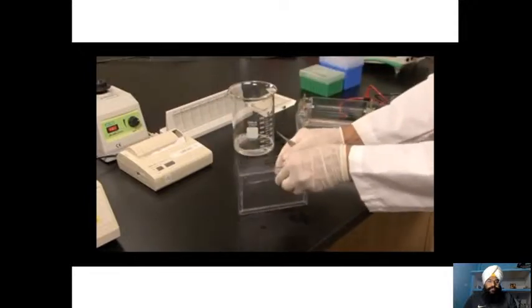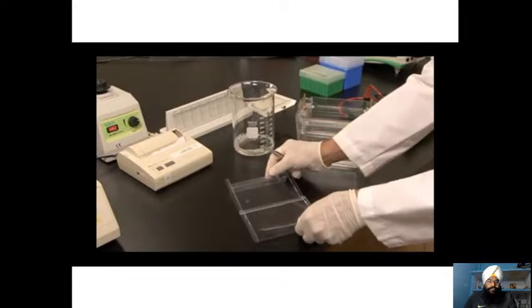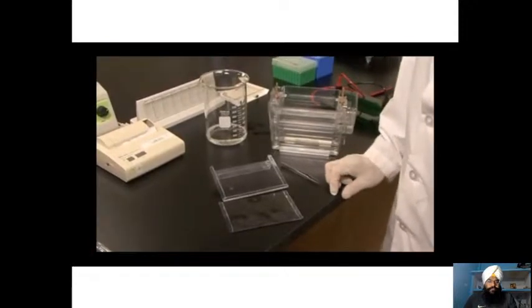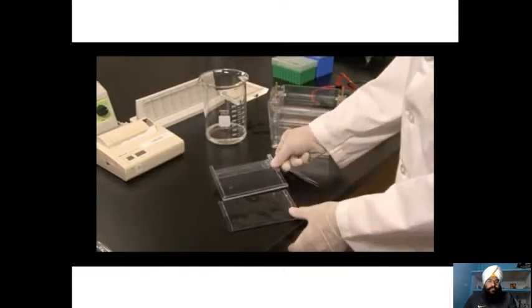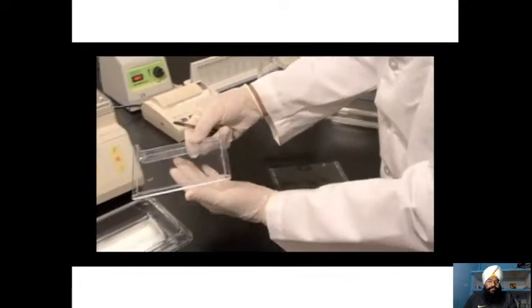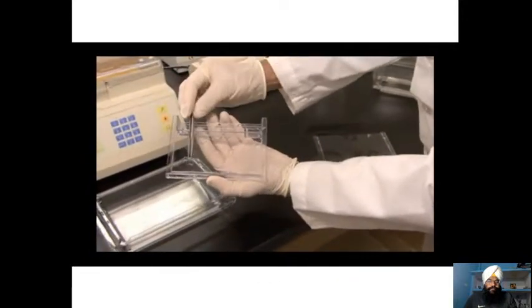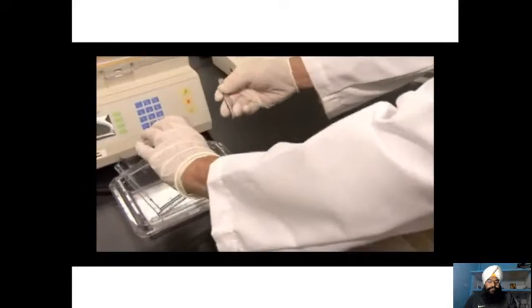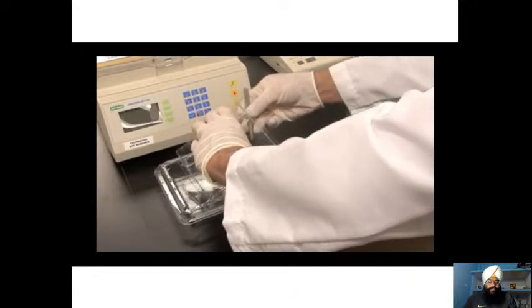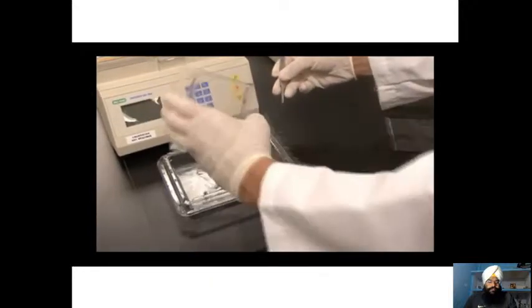So fold open like so. After I open the gel cassette, I use forceps to remove the IPG strip from the surface of the gel. Starting at the bottom of the gel, gently pull the gel away from the surface of the cassette. The easiest way to do this is to turn the gel upside down over the surface of the staining solution, remove a corner, and remove a corner until the gel falls into the solution.